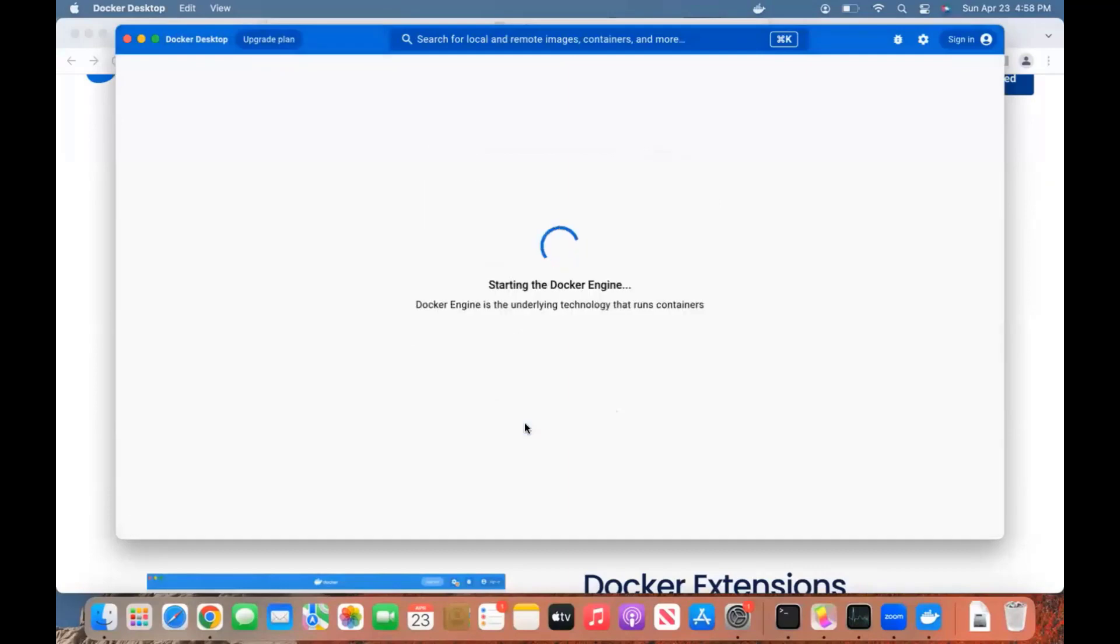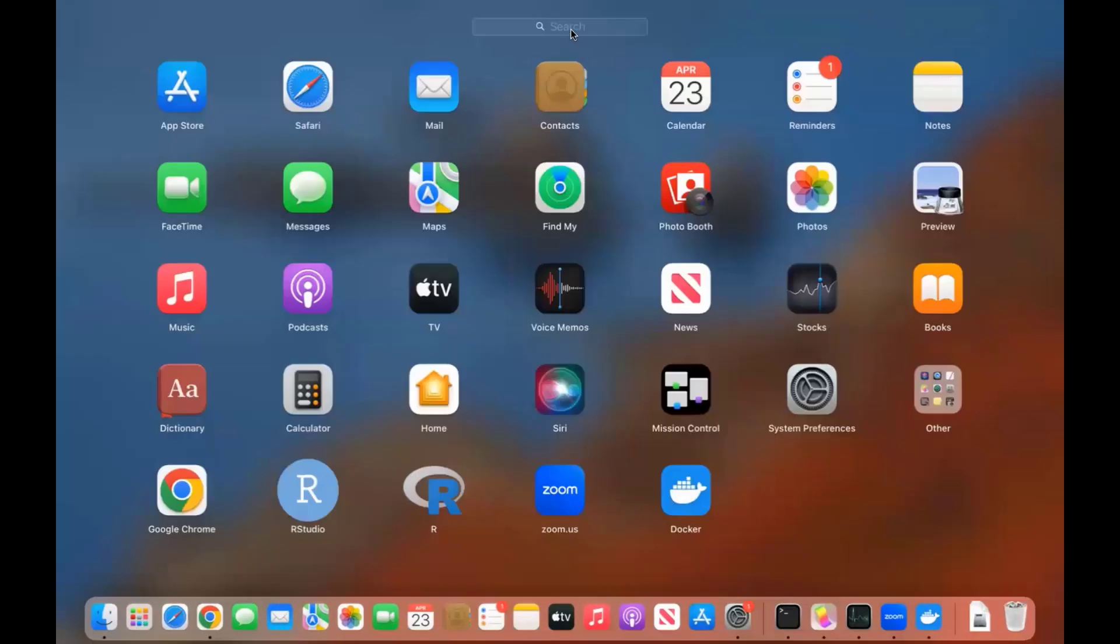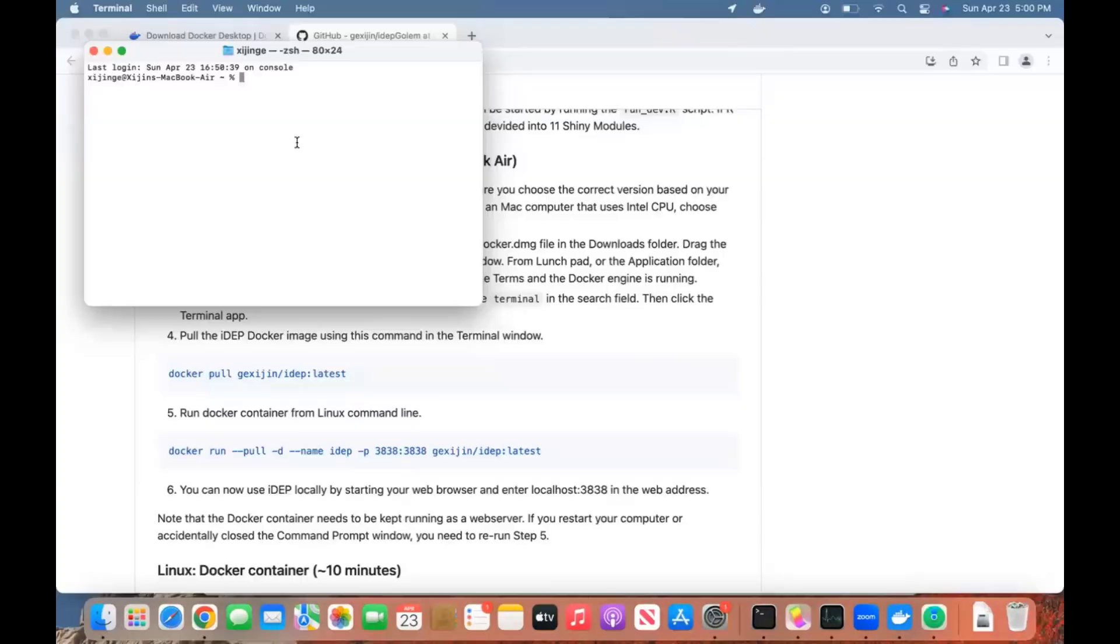The Docker engine is starting. Now start a terminal window. Go to Launchpad, and we're going to search for Terminal. There's the terminal window.